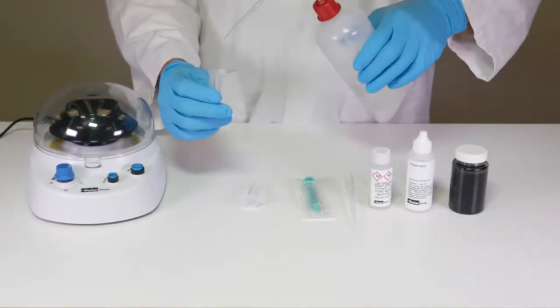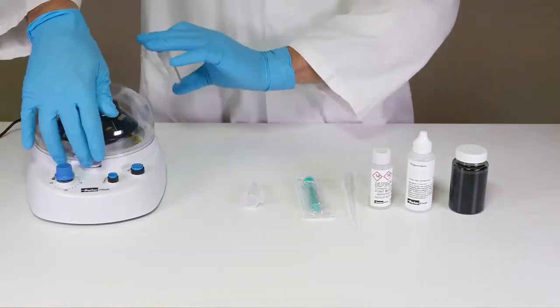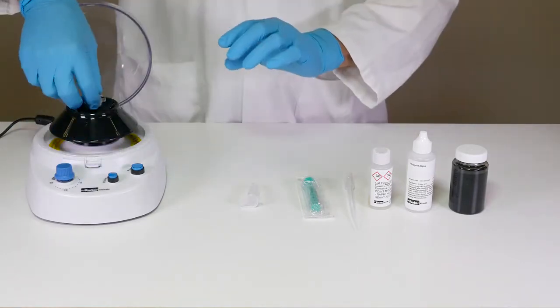Firstly, fill one of your test tubes with water to the five milliliter graduation line. This is to ensure the centrifuge is balanced correctly.